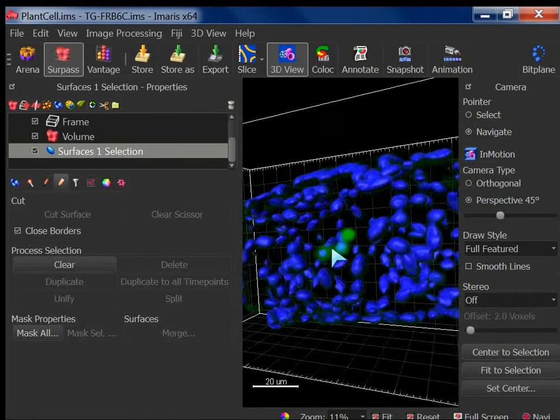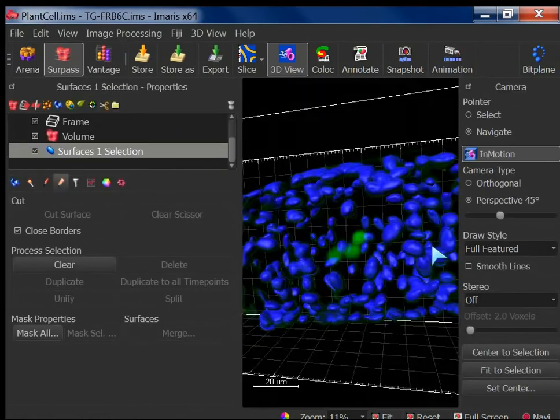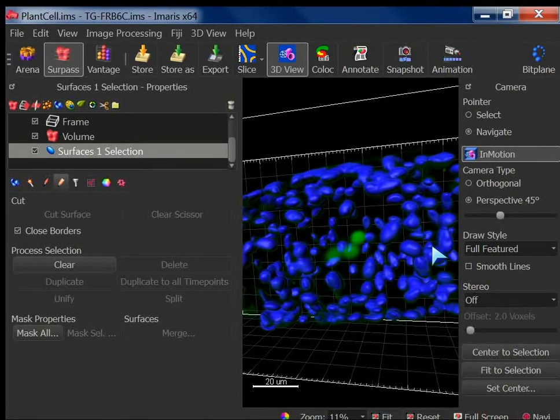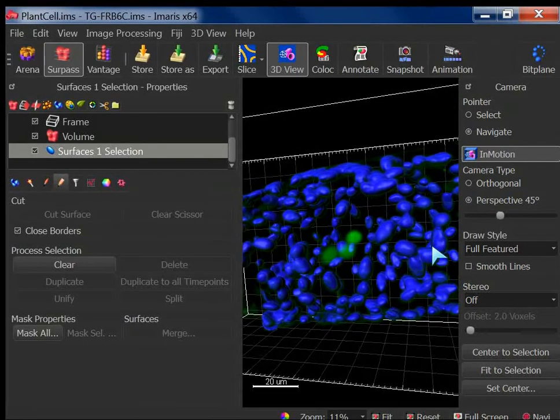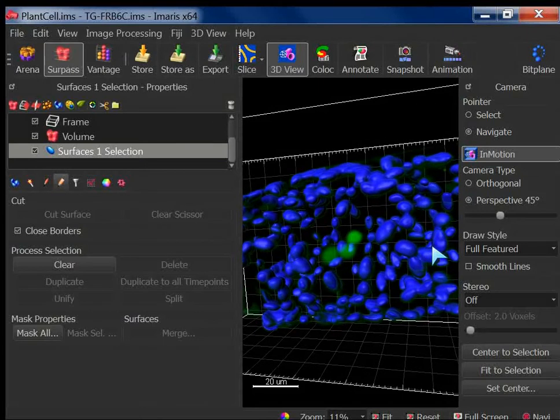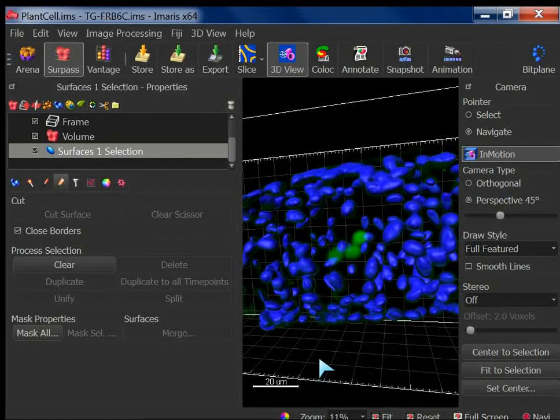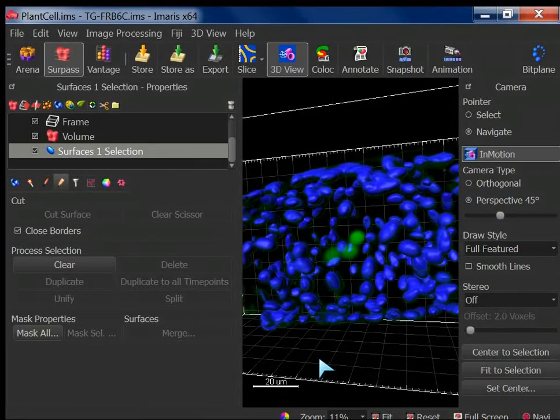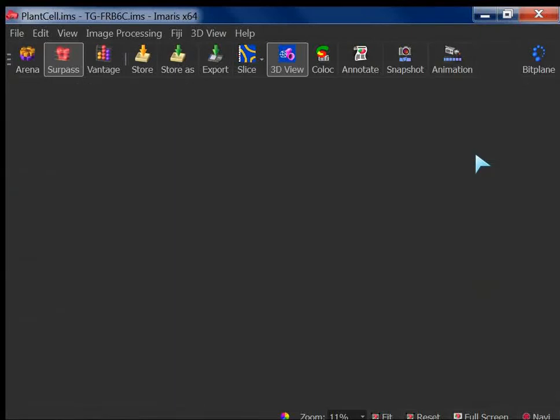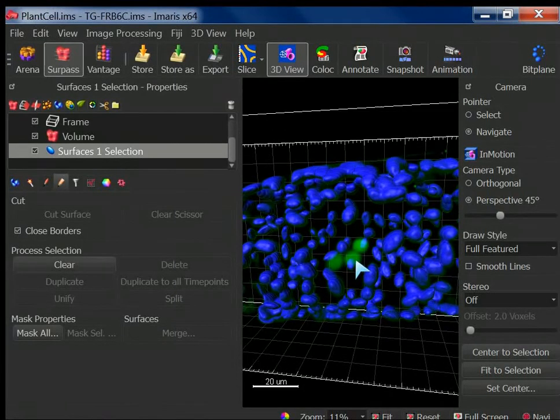That's the mouse. Very interesting is the in motion. This is a very important feature. So here you can see you don't have to change all the time, but you can kind of guess what is the depth and what is your object of interest. But again, this is very computationally expensive, so it works only for the smaller data set. But for 3D, it's very, very computationally expensive. So I switch off this, and I focus on now I will create.